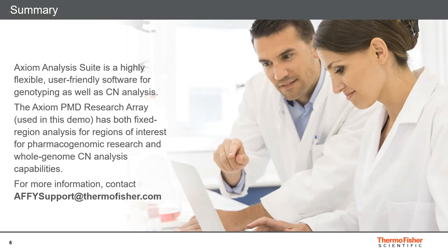Let's review. Now that we've gone through some of the basic features of copy number analysis with Axiom Analysis Suite, please refer to the Axiom Analysis Suite user guide for a full listing of available features. Axiom Analysis Suite is a highly flexible, user-friendly software for genotyping as well as copy number analysis. The Axiom Precision Medicine Diversity Research Array used in this demo has both fixed region analysis for regions of interest for pharmacogenomic research and whole genome copy number analysis capabilities. For more information on any Axiom Array or the Axiom Analysis Suite software, please contact affysupport at thermofisher.com.